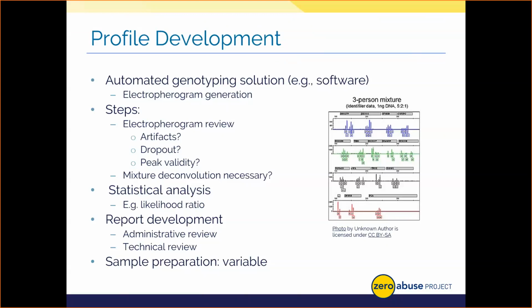Now, once your profile is cleaned up, we can use a database of allele frequencies and calculate the rarity of a profile to then use statistically in a court of law. We'll then write up your report, which goes through 2 reviews. A technical review is executed to ensure the methods and measures used were logical, while an administrative review ensures the report itself is sound. All of these elements can take hours to days or even weeks to accomplish. Arguably, most of the analyst's work will be devoted to this phase of evidence processing. Don't forget that it also takes time to scan everything in and out of our laboratory inventory management or LIMS systems to maintain chain of custody and allow you to retrieve your processed items.